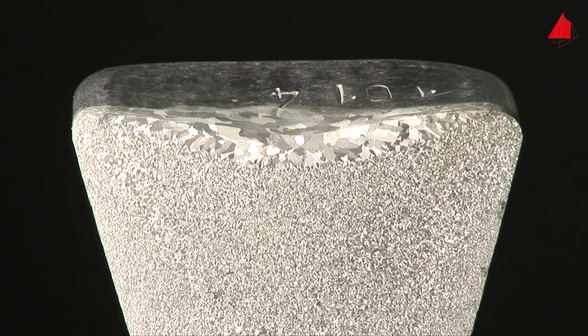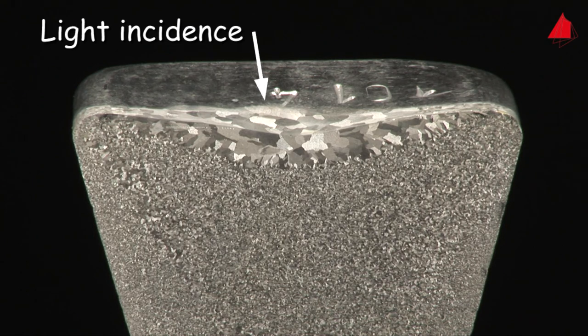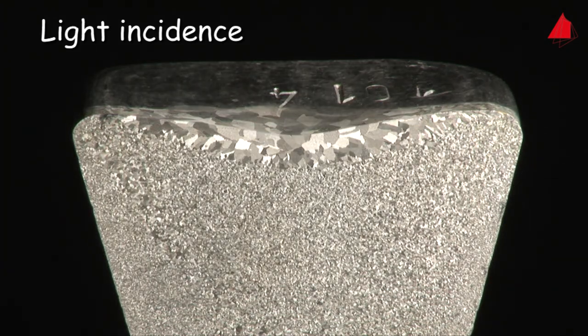But why are the grains only visible after etching? The reason for this is that the etchant structures the material grains on the surface according to their crystal orientation. Experts call it grain contrast etching. At lateral illumination, the individually structured grains reflect the light in different directions and the grains become visible.